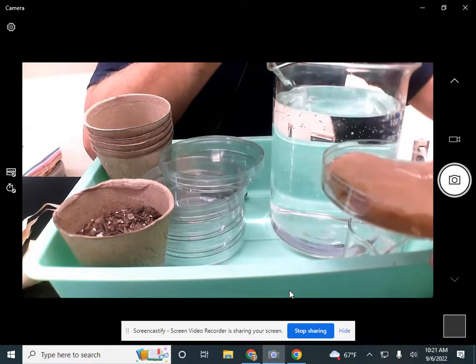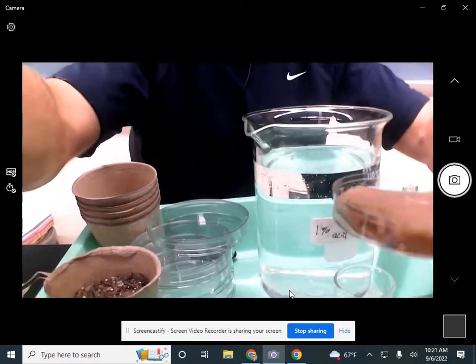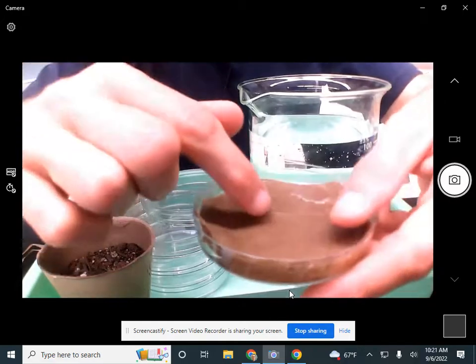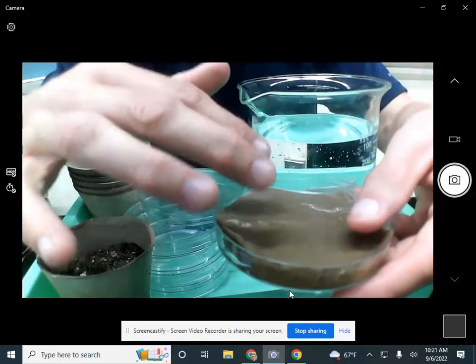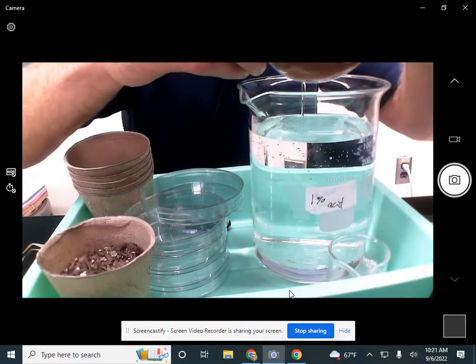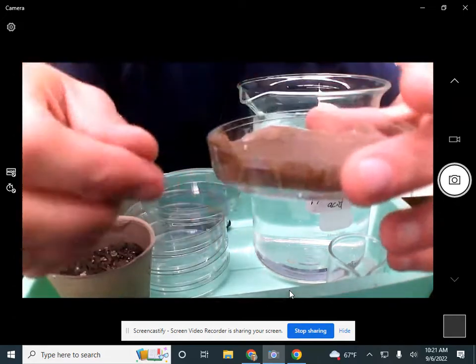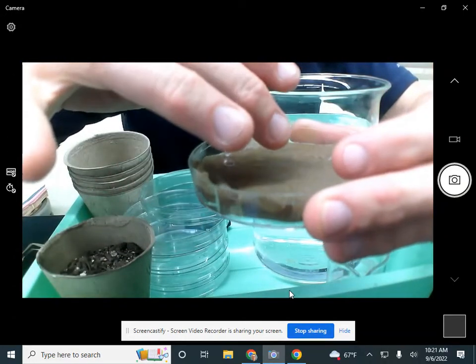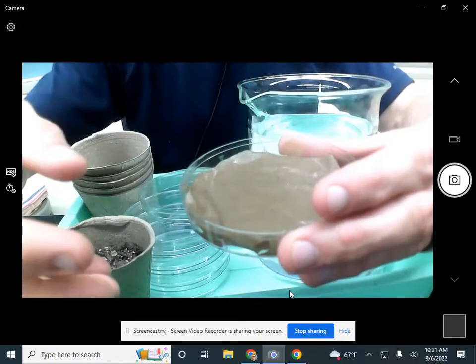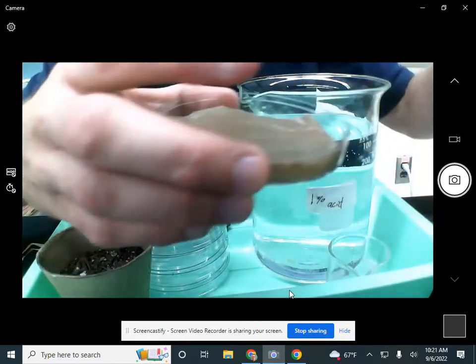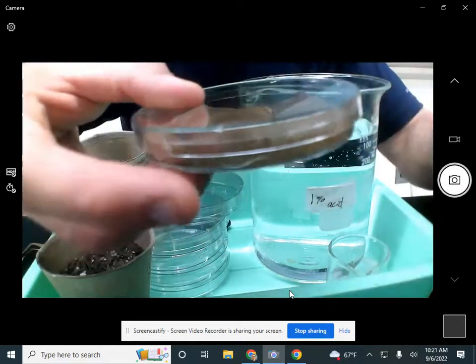So no one's using water out of the tap. You're using this acid I've provided to you. Now this paper towel, you don't want it soaked. You don't want it to look wet. So if you have to pour a little bit off, that's okay. You want it damp. If it's wet, they're going to rot. So damp is what you want.